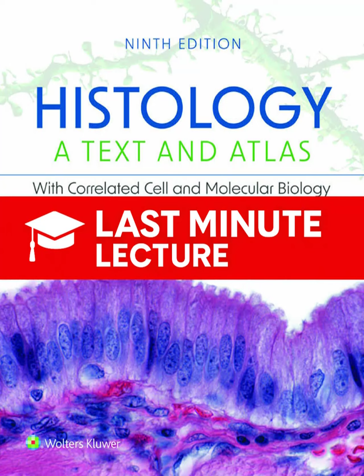And finally, we have to talk about pushing past that 0.2 micrometer limit, entirely: super resolution microscopy. This is a whole group of methods that achieve resolutions down to 10 to 100 nanometers. They do it using computational and physical tricks to isolate single photons or manipulate the light spot size. Like STED microscopy. STED, or stimulated emission depletion, uses two lasers. One excites a fluorescent spot, and a second donut-shaped depletion laser forces the excited molecules at the edge of the spot back to the ground state.